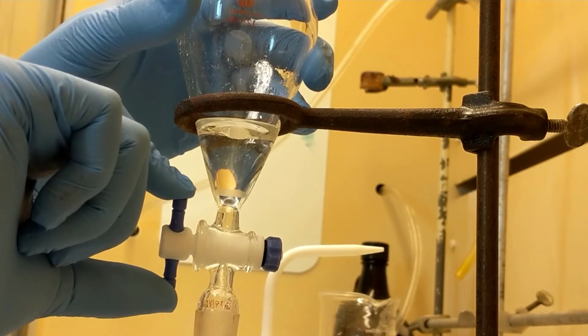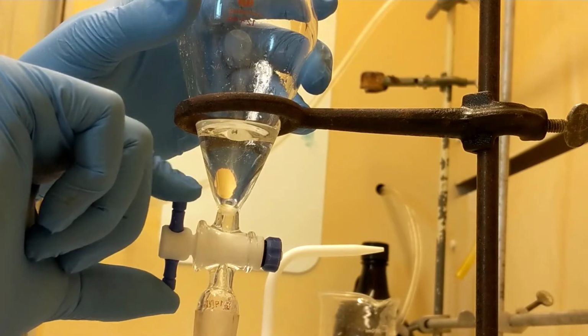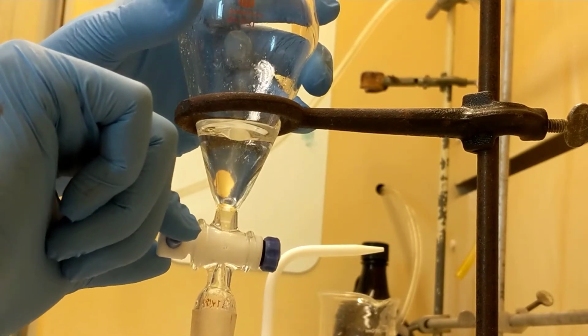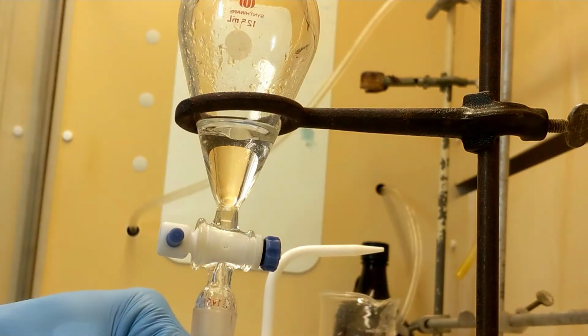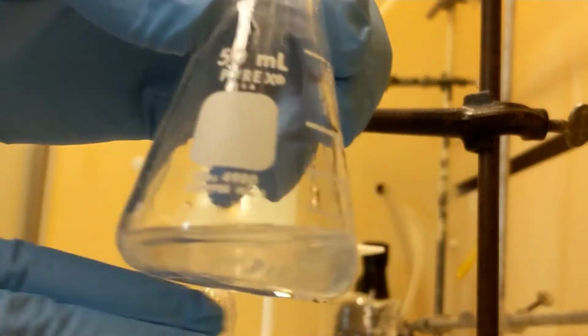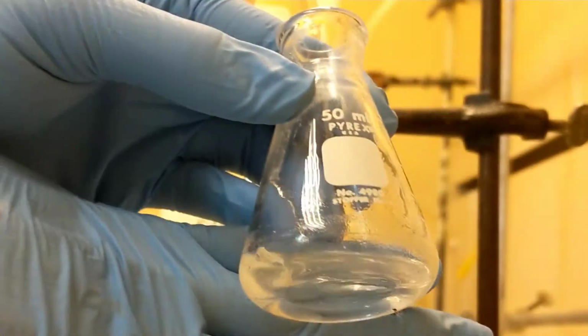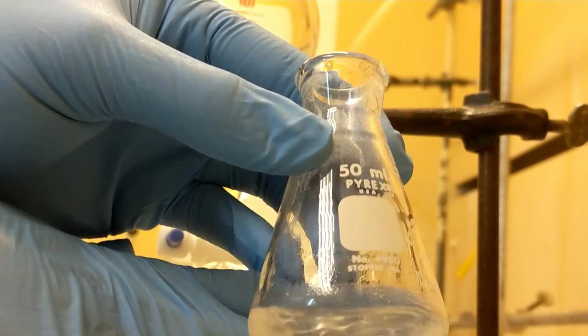Rotate it down, put it all the way down at the very bottom, and closed. I'll take that last drop. Here you go. That was my second extraction. Let me back up. Yeah, that's my second extraction.